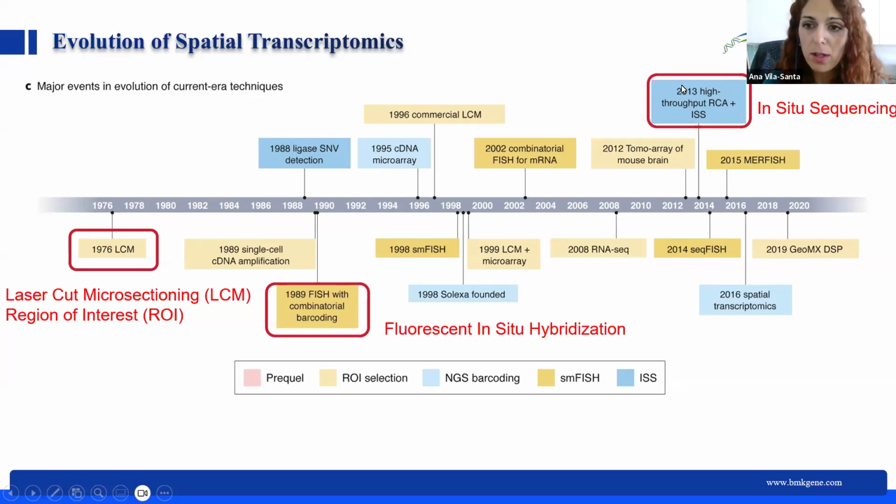It basically also used targeted genes and a rolling circle amplification that would create a fluorescent output that was then read with a microscope. And this enabled reading the expression level of the targeted genes around the different parts of the tissue. But now we have spatial transcriptomics that enables us to study the complete transcriptome without targeting specific genes. So let's dig into how it works in theory.